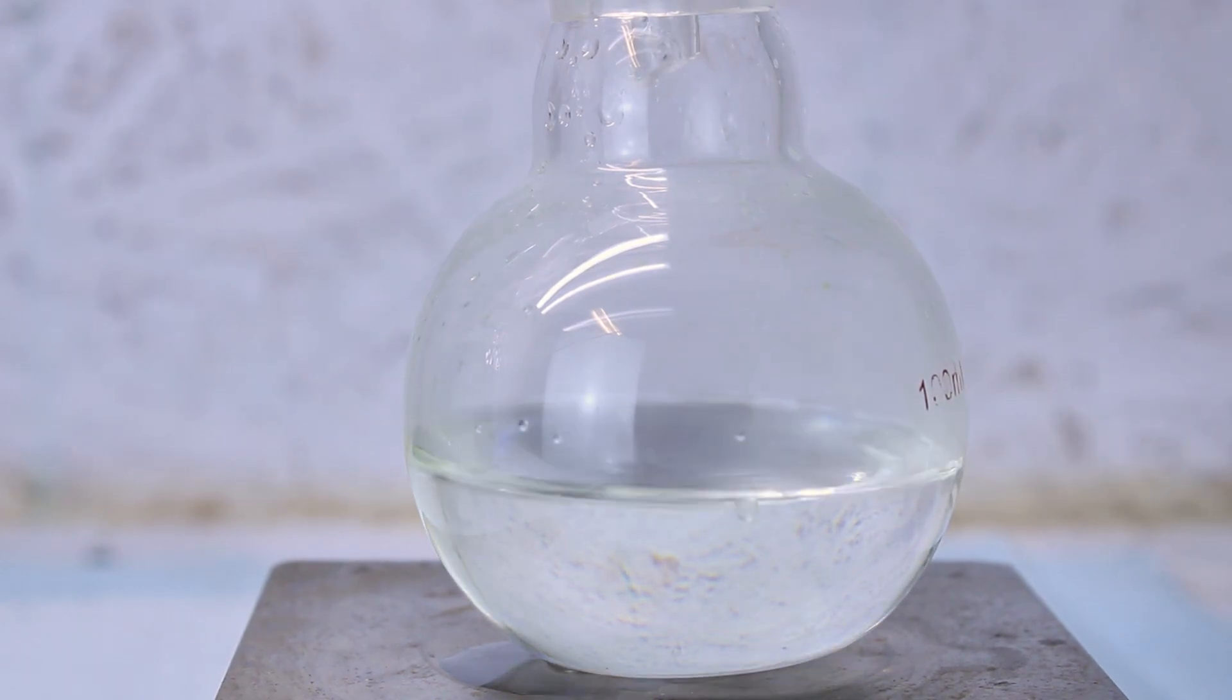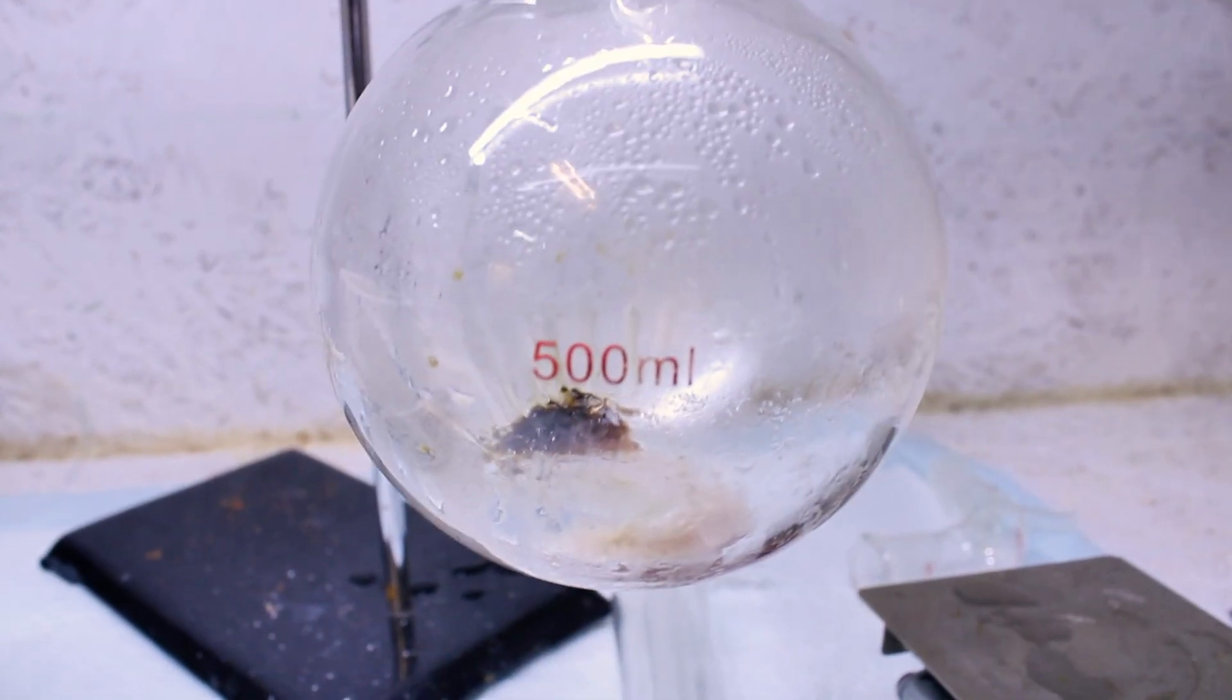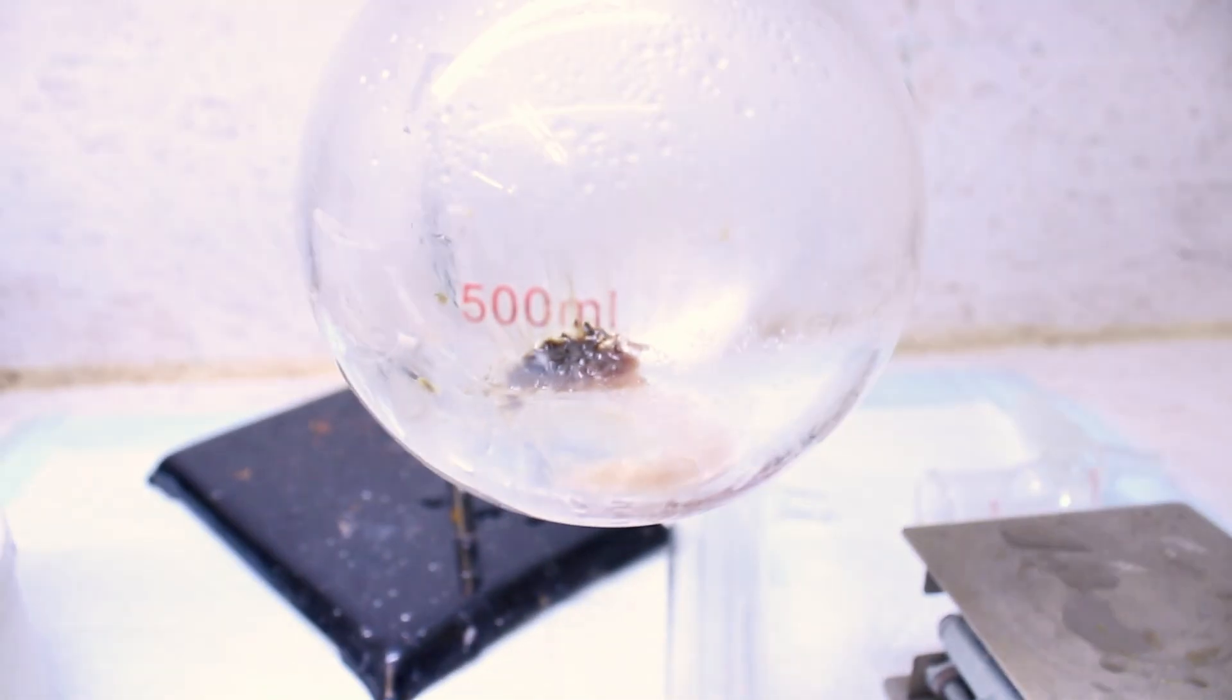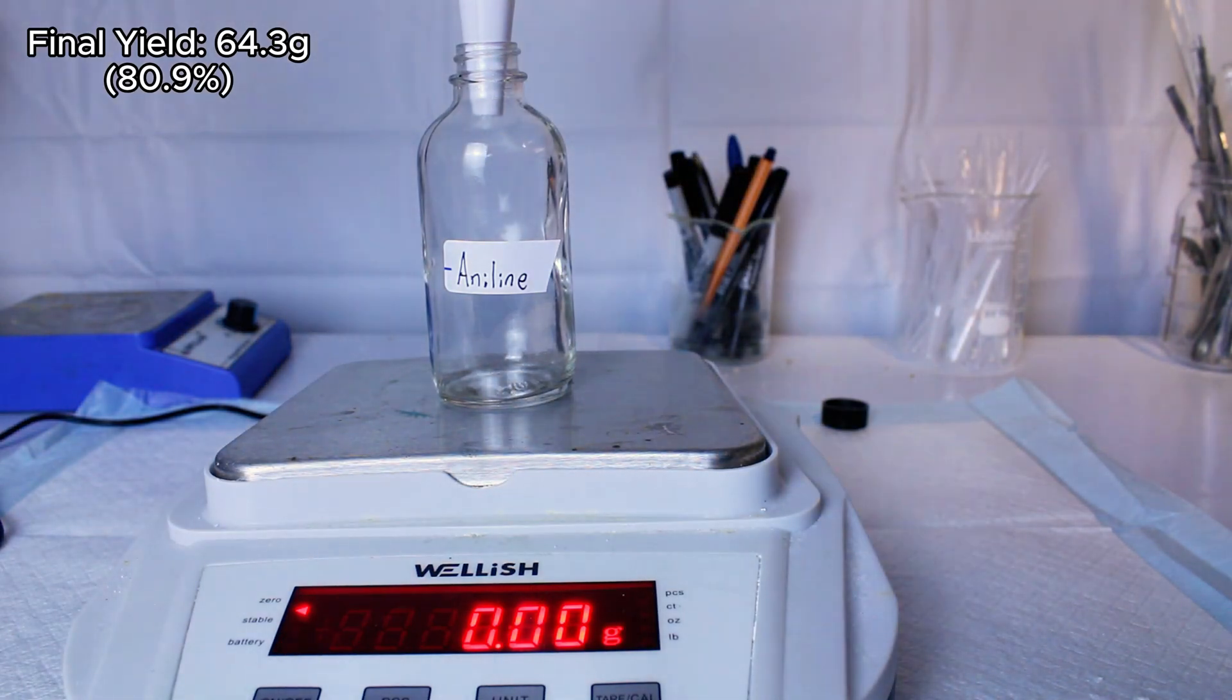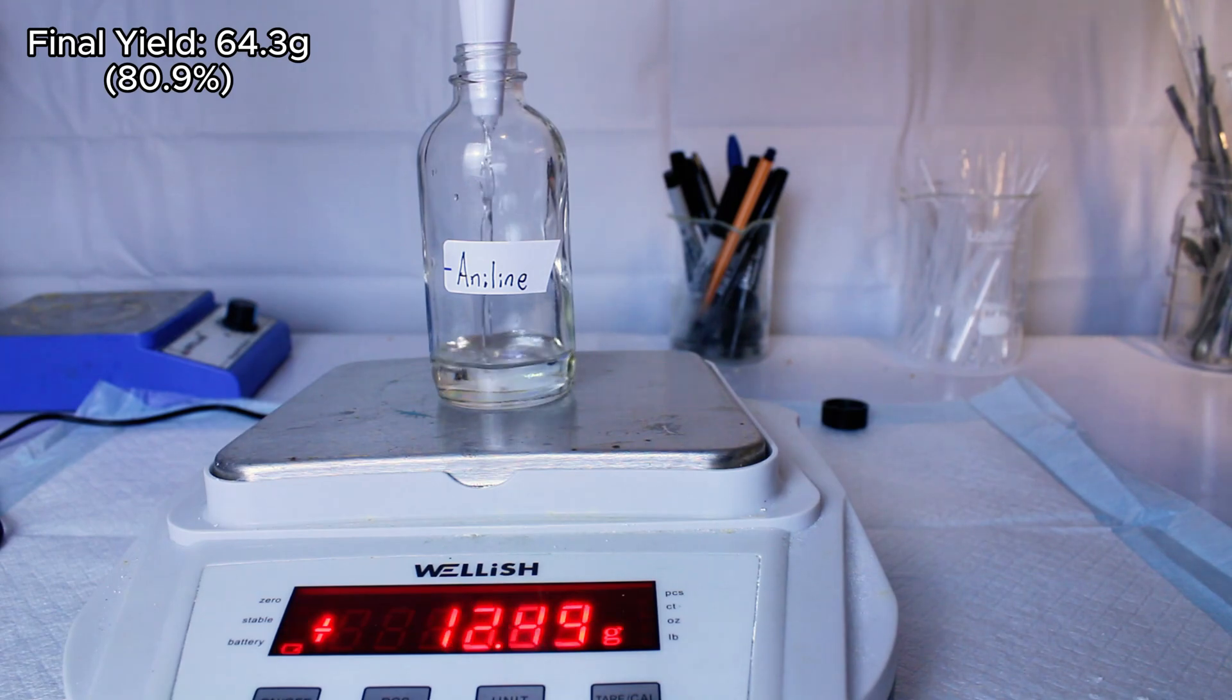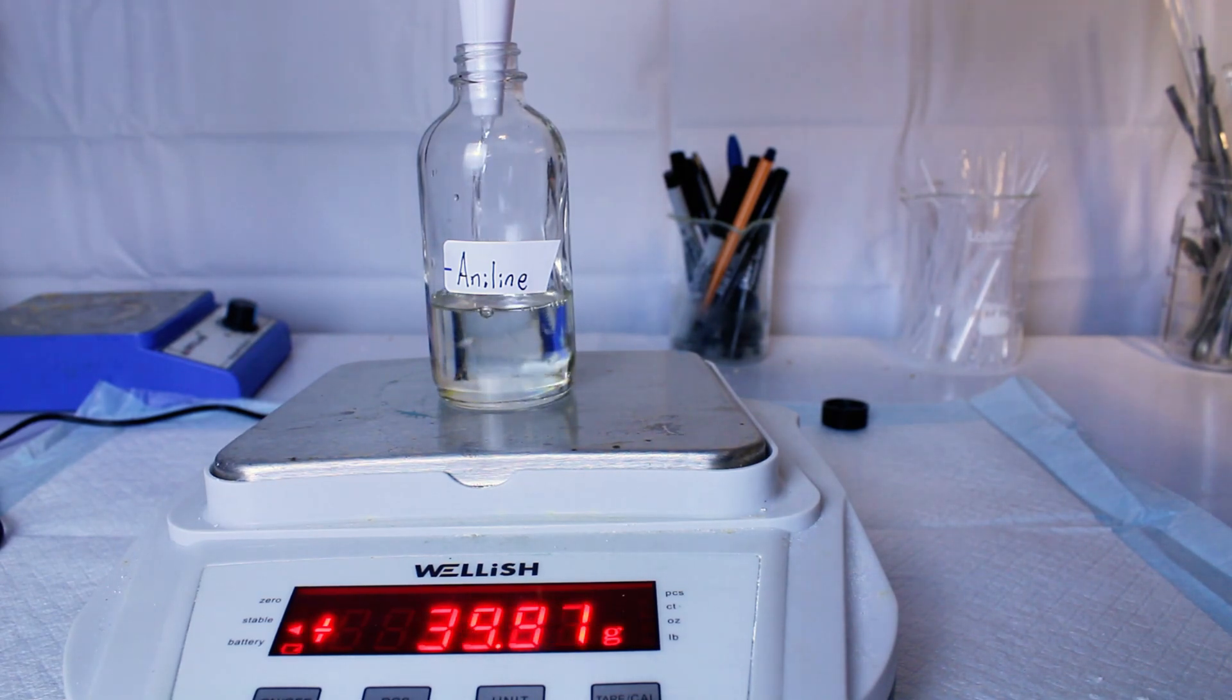Now, when this redistillation step is complete, there's a bit of blackened tar left in the boiling flask, and I collected 64.3 grams of mostly pure and mostly dry aniline. This represents an 80.1% yield, which I'm pretty happy with, especially considering how much lower my overall yield would be at this point if I had started with benzene.